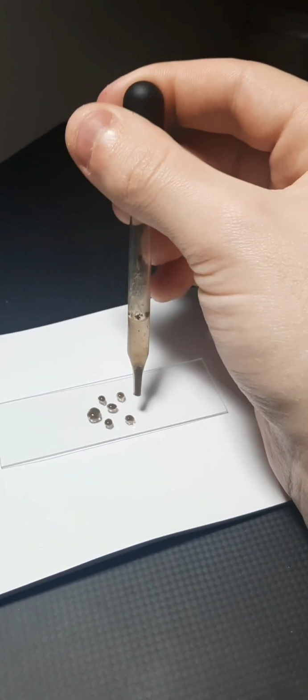This creates little soil islands, as you can see on the left, which equally separate the total soil concentration, as opposed to the usual method of just bunching it all into the middle, like the slide on the right. Our devised method on the left is beneficial because decreasing the amount of space in which an organism can hide yields clearer observation opportunities, especially with completely transparent zones between islands for the clearest possible contrast.